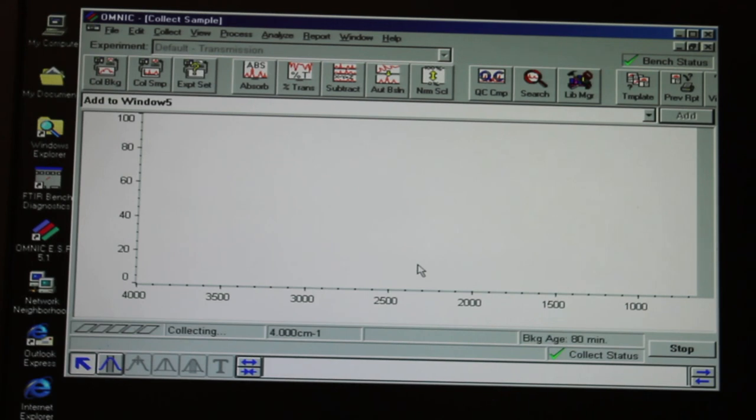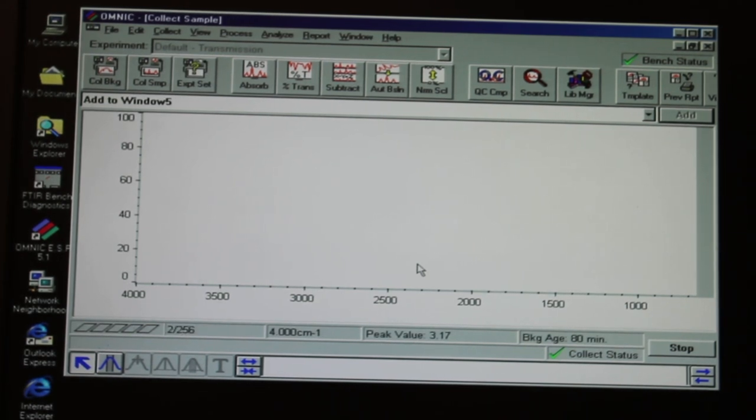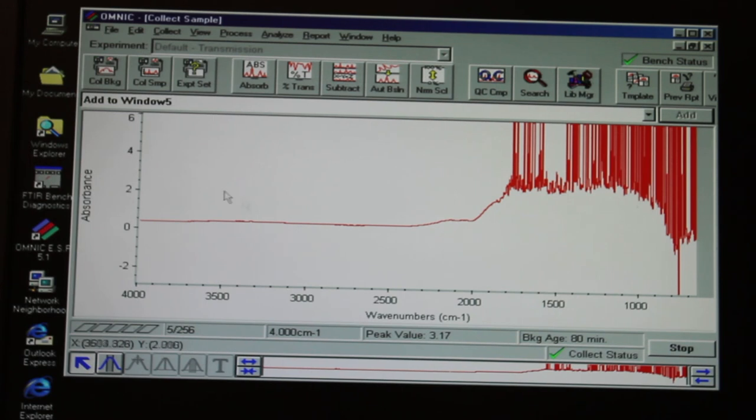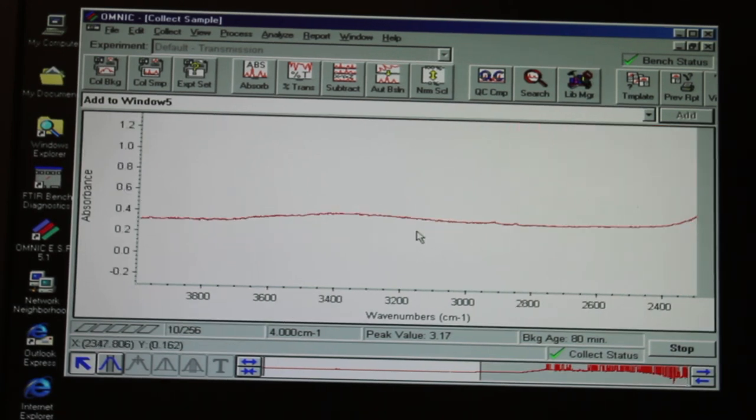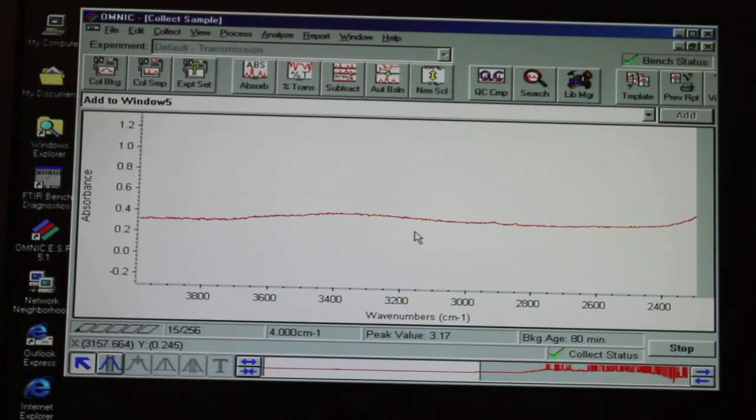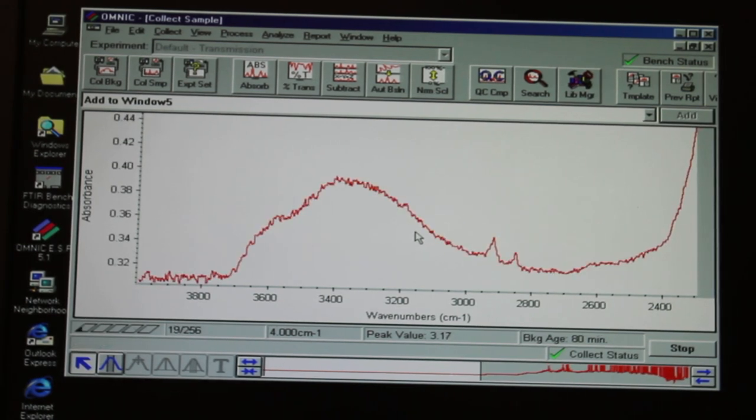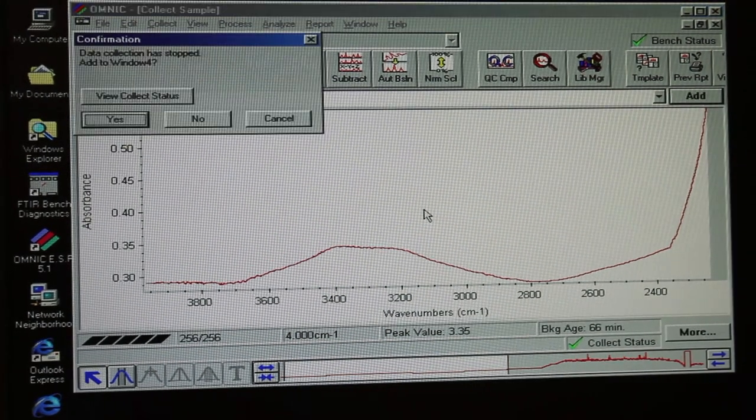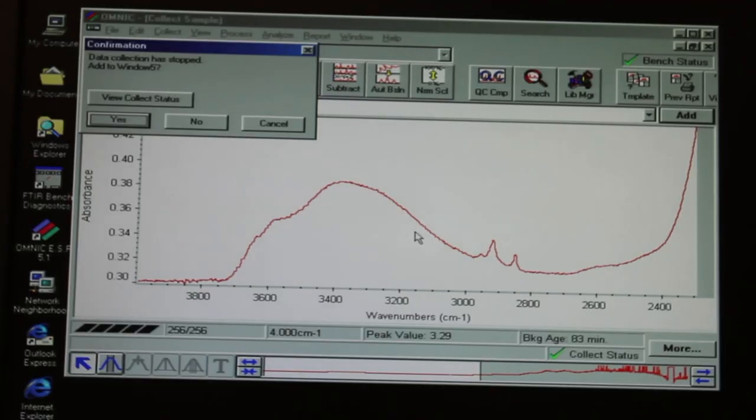You can see the progress of data collection by looking at the bottom left side of the window. In this example, we're collecting 250 scans and averaging them together. You can also select a certain area of the spectrum to highlight while obtaining the data.